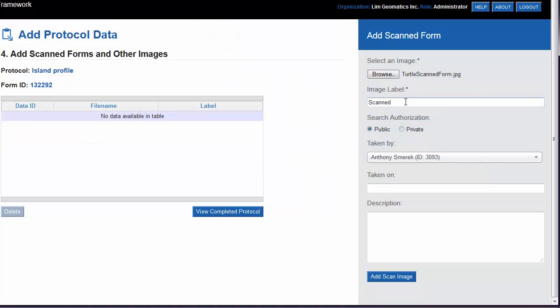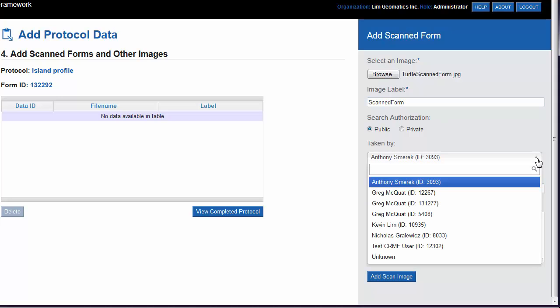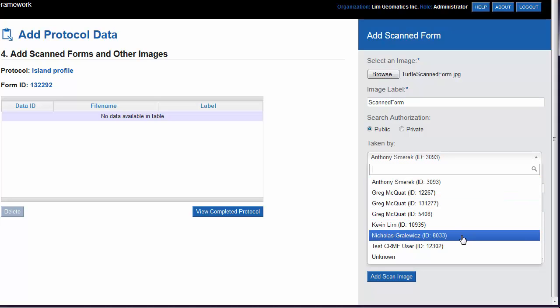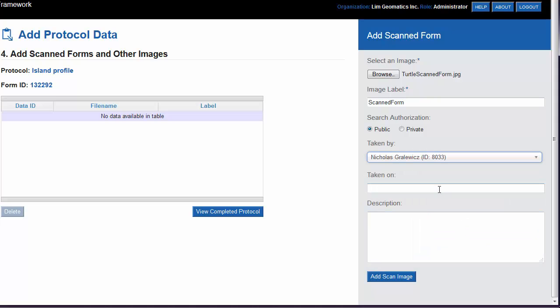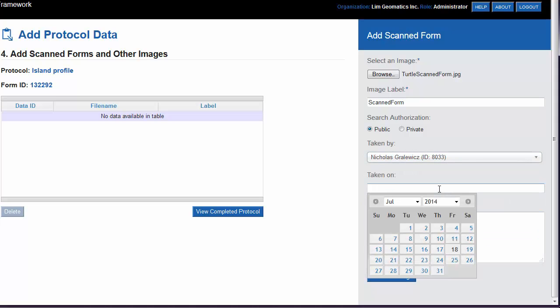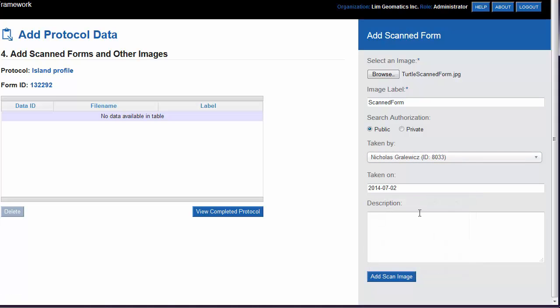Provide it with a label. Select who completed the form. Give it a date and a description. When we're done, we click on the Add Scan Image button.